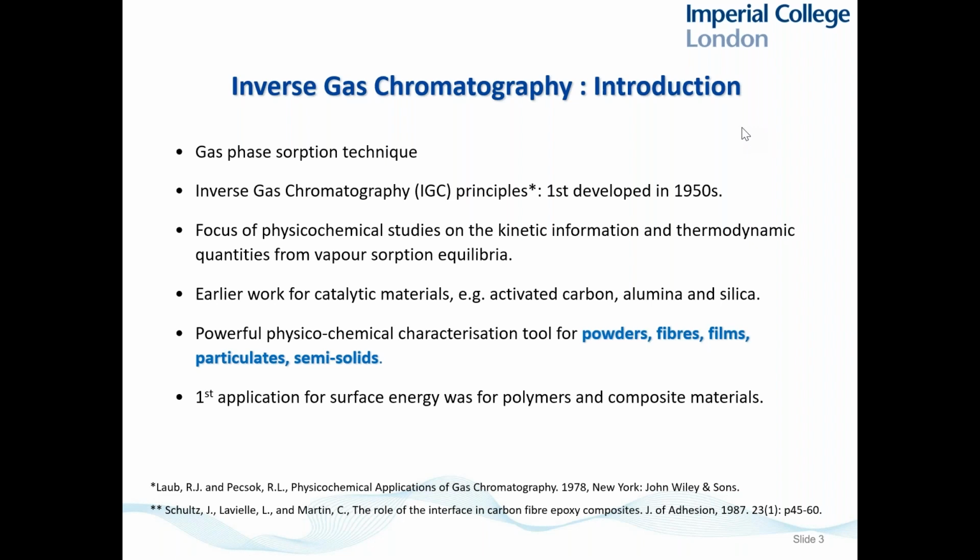It basically focuses on determining kinetic and thermodynamic information for a solid powder, a pharmaceutical powder in many cases today, based on the adsorption of selected probe molecules. It can be used for catalysis materials, pharmaceuticals, many materials. And we'll see that it's been around for probably 50 years as a research technique in universities and has been commercialized by Surface Measurement Systems over the last 20 years.